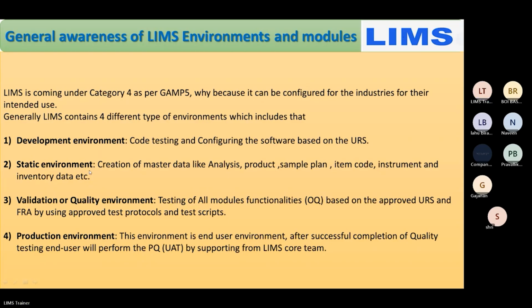That is because they are going to create the master data inside that software. They have to fill up the database, and that is how the brain of the software is created. Then comes the validation or quality environment, where it will be tested. The engineering team and the end user team are involved in it. In the production environment, the actual end user who is going to work on the software or instrument is involved in production environment testing.